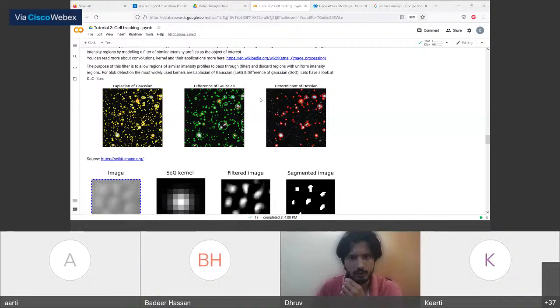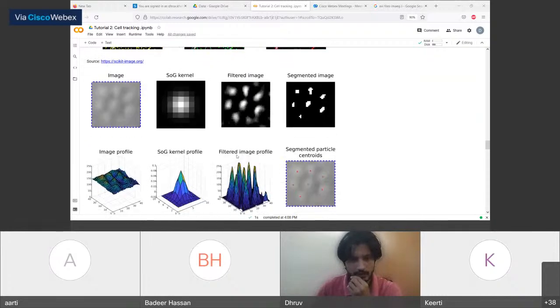If you use Image2Numbers, you will see that there's an option for filtering, and you'll see multiple filters there. You'll see the Gaussian filter, and as someone mentioned in the chat, the median filter and the averaging filter. I think the median filter is used for denoising. It's not really used for filtering out objects. So if I do any median filtering here, I don't think I will get any good results.